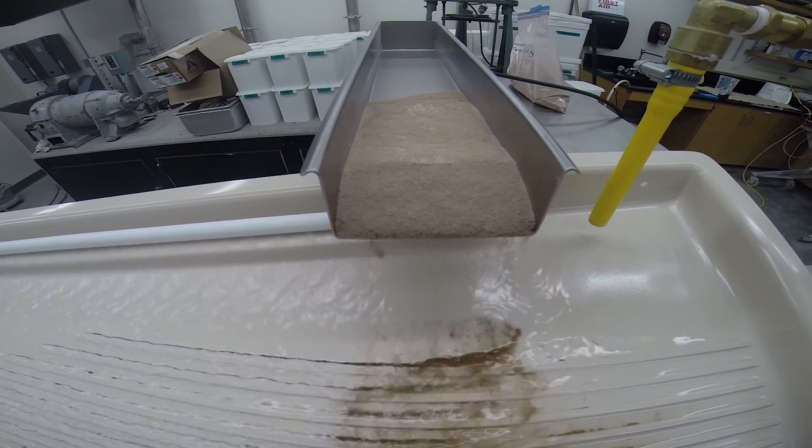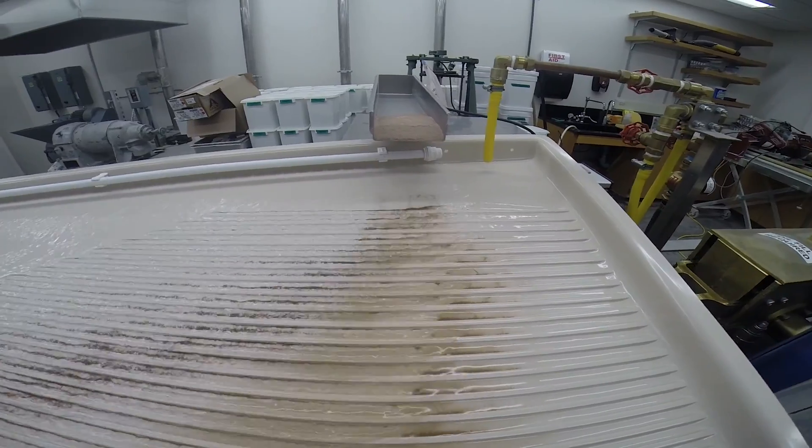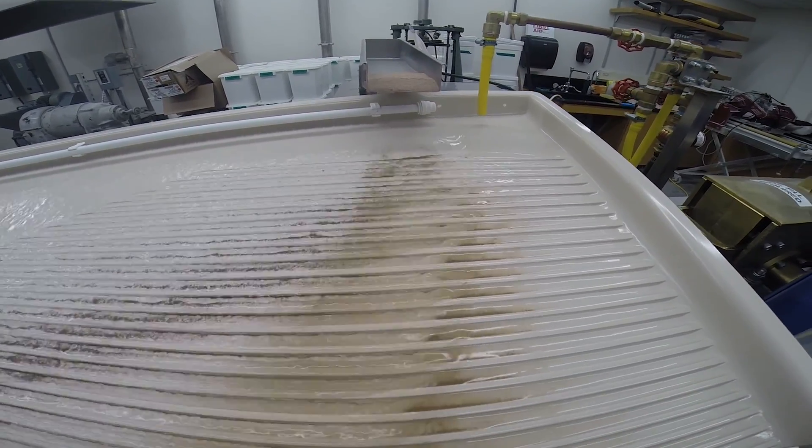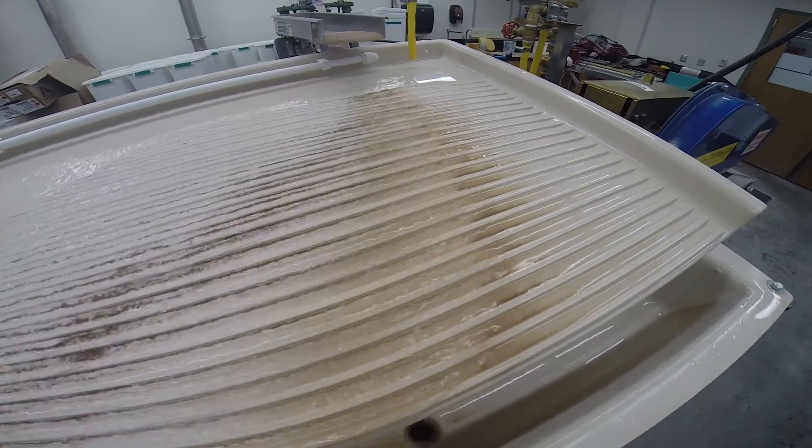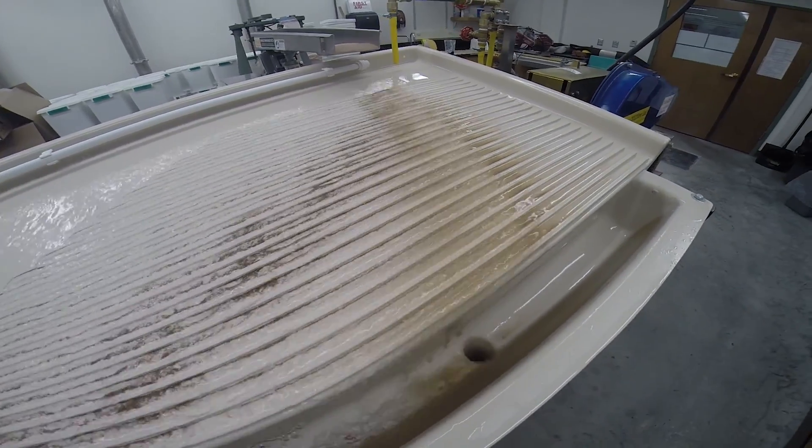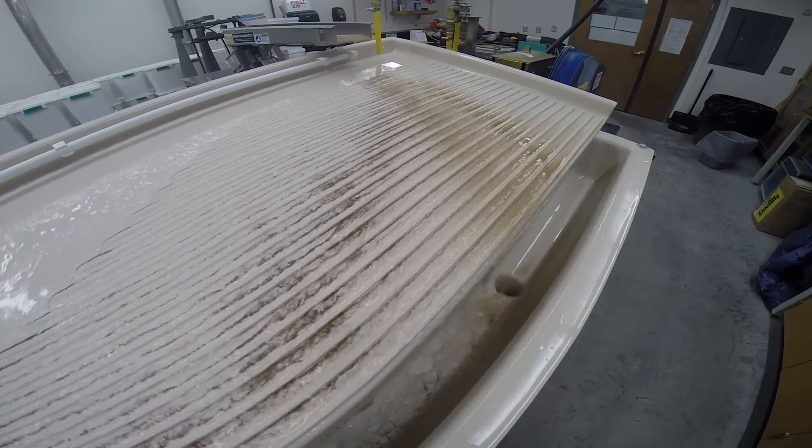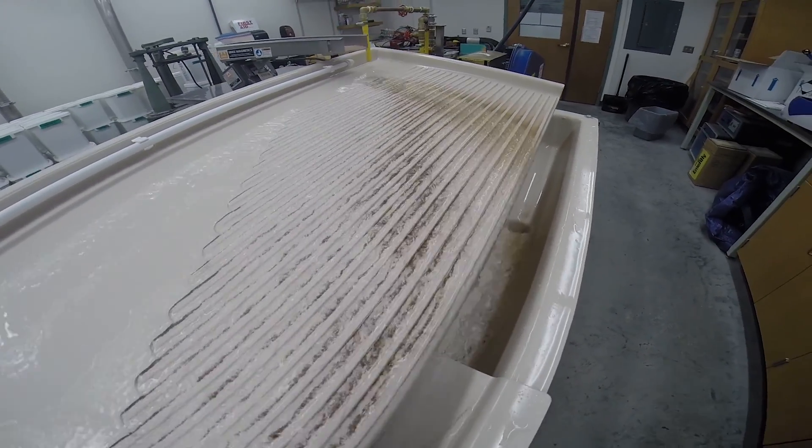The first step in the process is a Wilfley table. Another property of our amazing zircon is that it is very dense, on average about two times as dense as most common minerals. To take advantage of this property, we pour the rock powder onto this slanted, wet, shaking table.